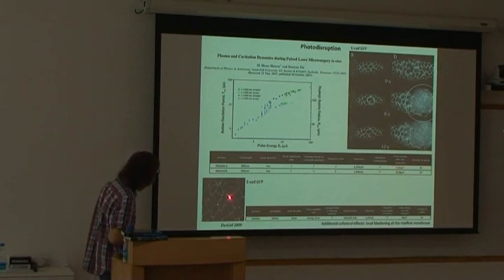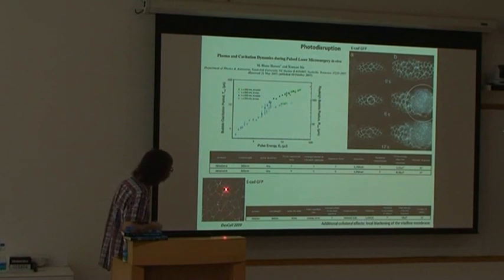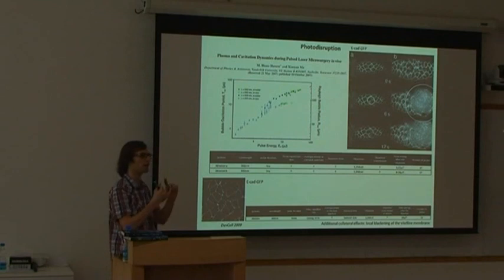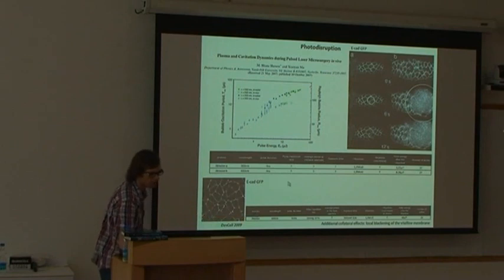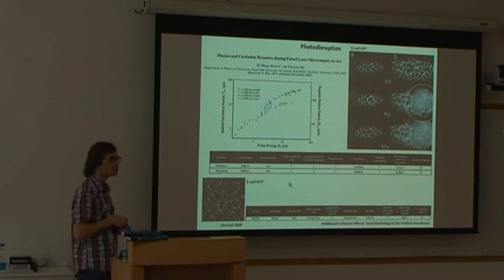So this is very interesting because this work wants to study the tension along junctions, okay? But there's no control of whether there is formation of any kind of bubbles, or any kind of shock waves. So I can show you this movie, but from the movie you cannot judge much. You cannot say. So what this work normally should need is controls.